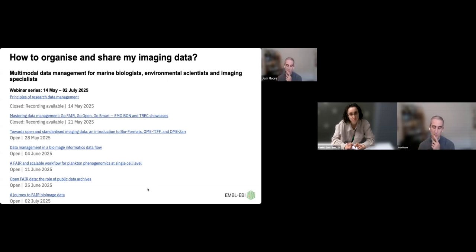And then there are still some cases that we're working on, especially where the input file format has lossy compression. So I'm thinking of whole slide imaging with, say, NDPIs. There's still a situation where we assume everything that's coming is with lossless compression, and therefore it gets much larger. And so that's something that the community is actively working on: let's accept the fact that there's lossy compression involved and keep the lossy compression in the output format. So certainly working on that. And if that's something someone's interested in, feel free to get in touch.